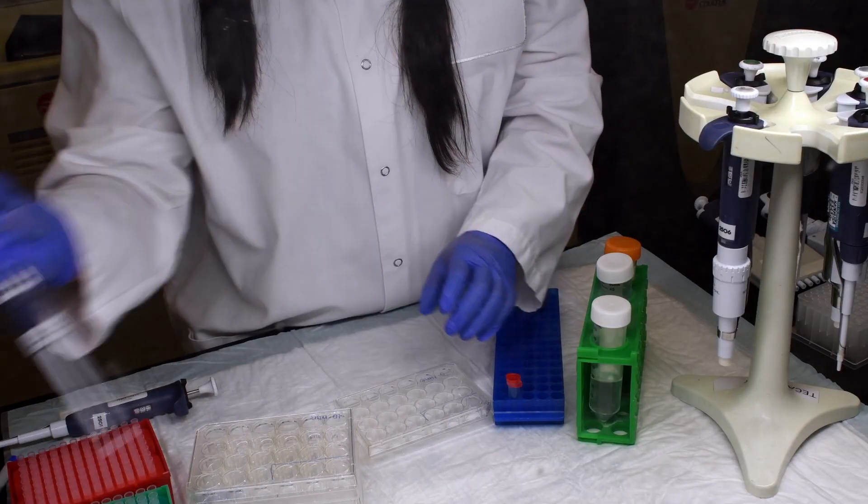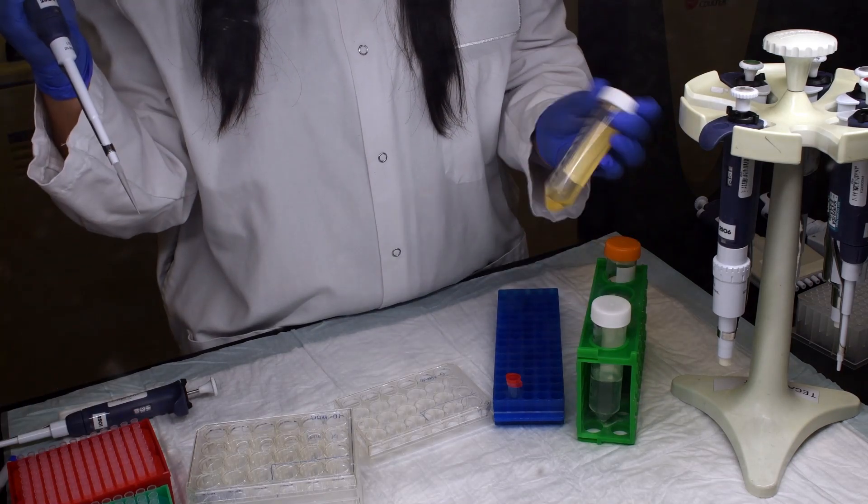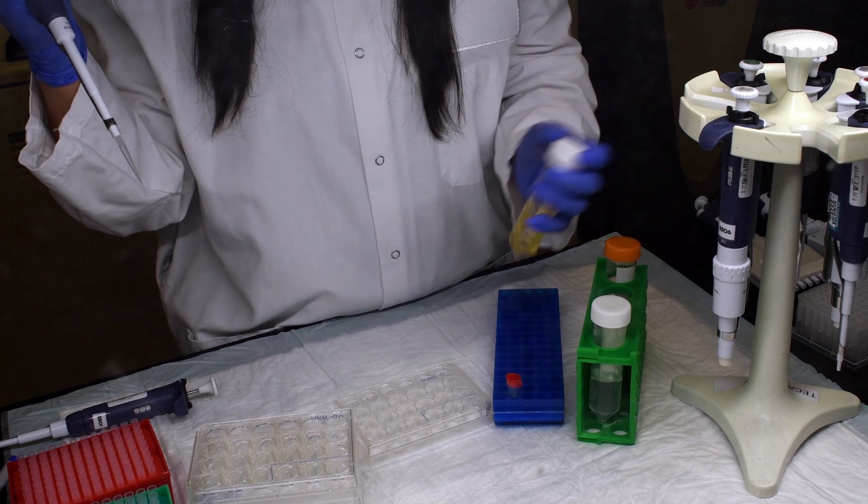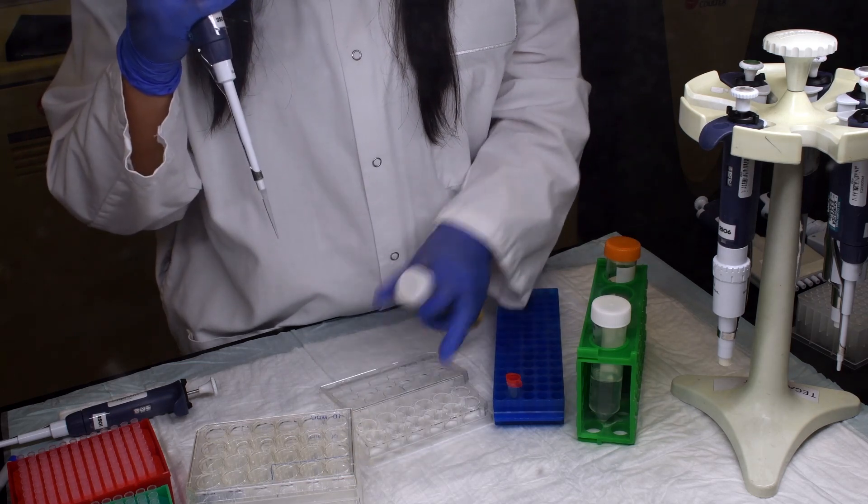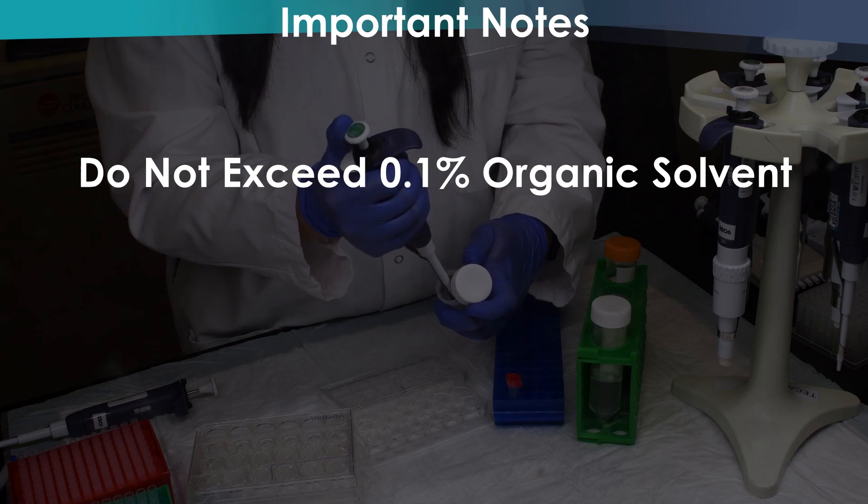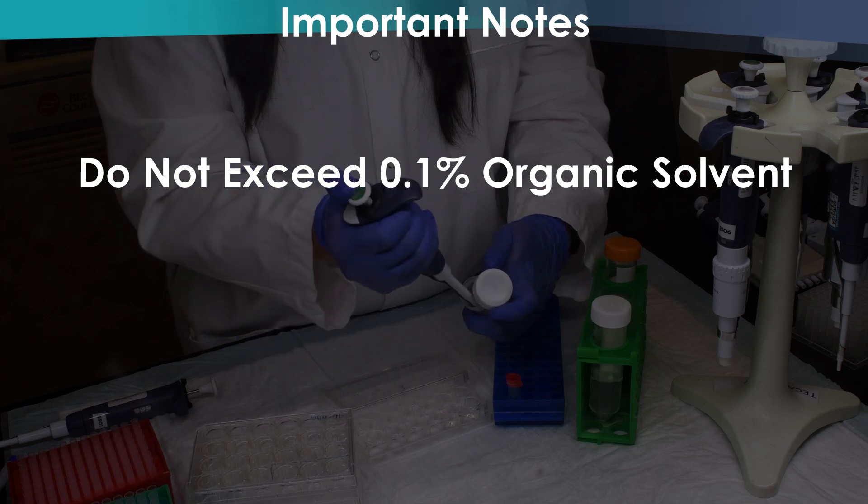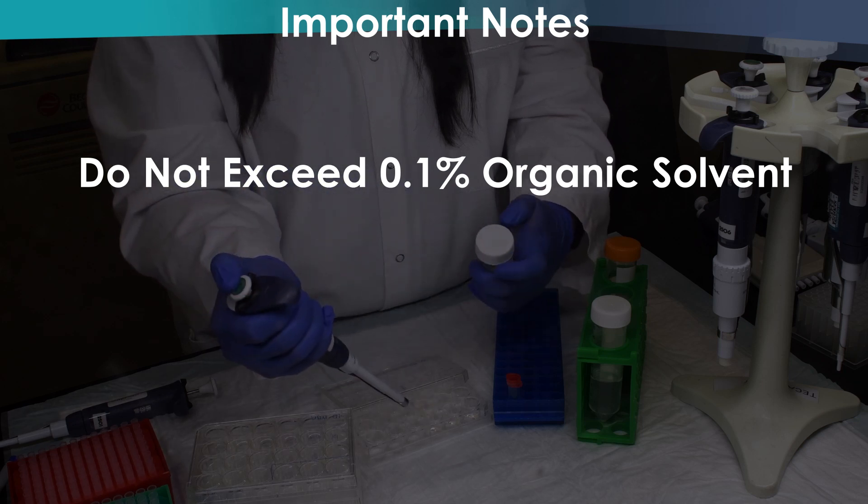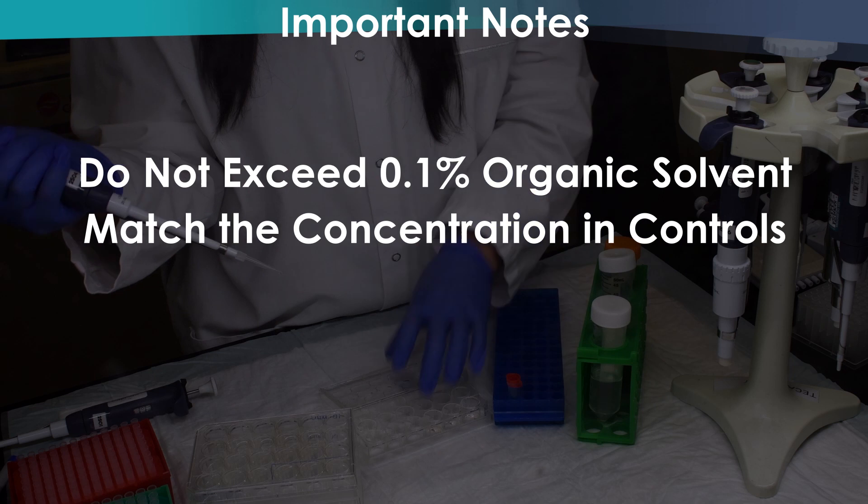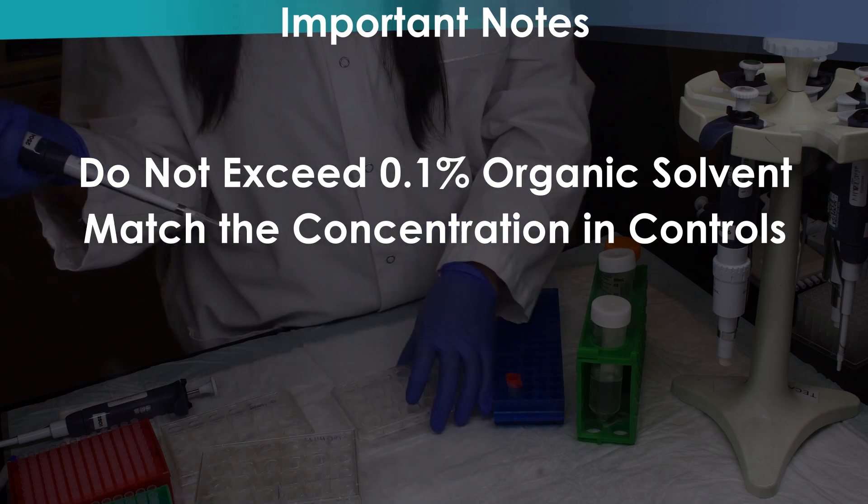Next, prepare incubation medium containing the test articles. When making the test articles stock, you will need to take care to make them in a way that when added to the incubation, the organic solvent does not exceed 0.1% of the final incubation volume. Sometimes this is unavoidable due to solubility challenges of the test article, but if you cannot stay under 0.1%, be sure to use the same concentration in your vehicle control wells to account for any potential interference from the organic solvent.